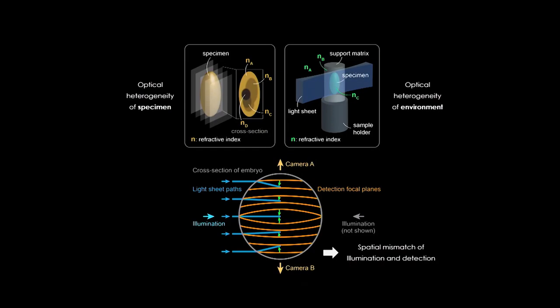But one thing I'd like to point out is that intentionally I said system resolution here, which means this is the performance we expect under ideal imaging conditions if you have a fairly transparent sample. And unfortunately, most of the samples we're looking at are far from transparent, and we end up in this realm of imaging relatively large specimens for live imaging, Drosophila larva, zebrafish brain.